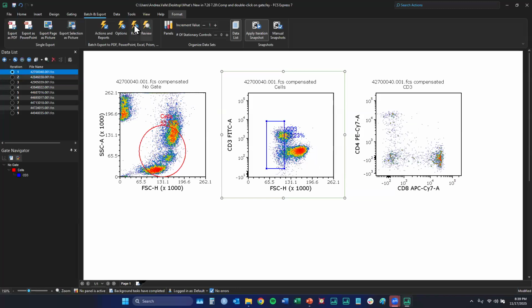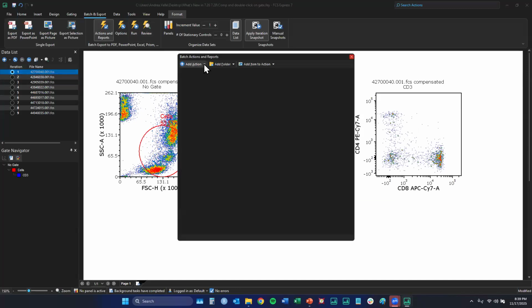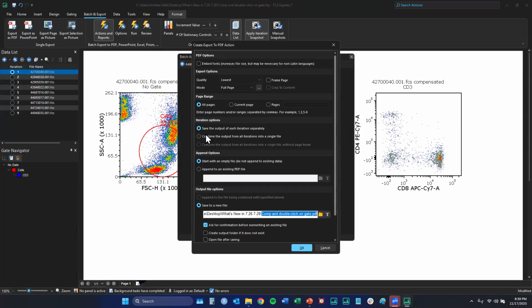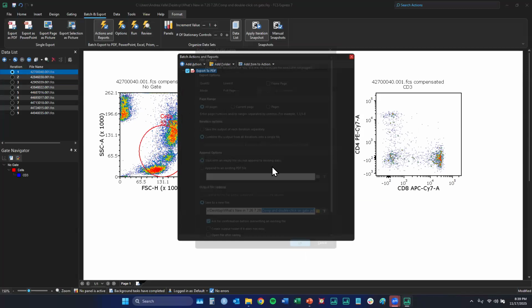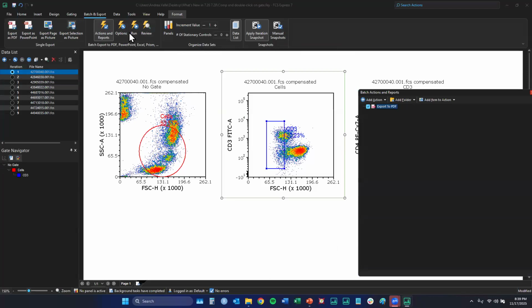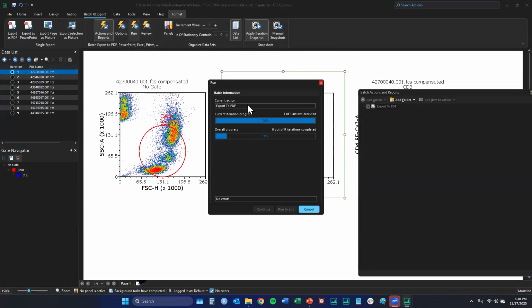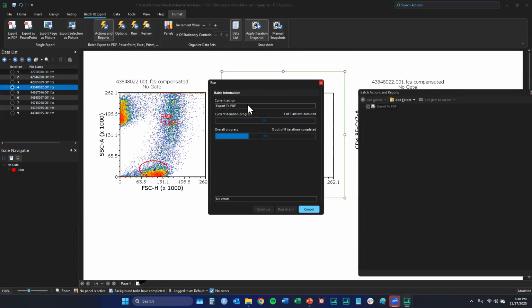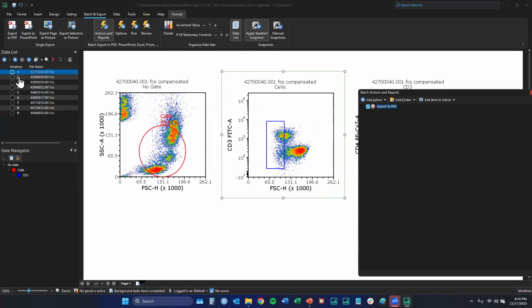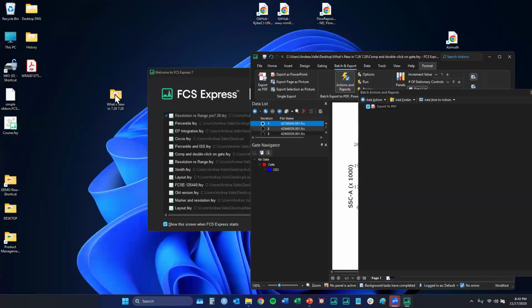It means that if I click on run, let me create an export. So this is the new batch dialog, by the way. You see the Excel, you see the Prism, okay? Let's save to PDF. Let's save in my folder, combine, everything else is the same. And now let me click on run, okay? With the apply iteration snapshot pressed, run will apply snapshot automatically. So in my PDF, you will see the position of the gates being different between the first two iterations.